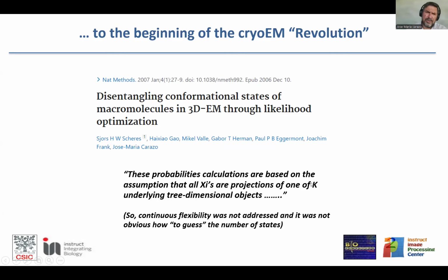So this K number of classes has always been very controversial, and people have tried with different cases. The goal, in very simple terms: what if we take away this assumption? What if we no longer impose on the data something that may not be proper for them, that they exist as a discrete set of states, and I have to use the number of states as a parameter of the alignment and classification?